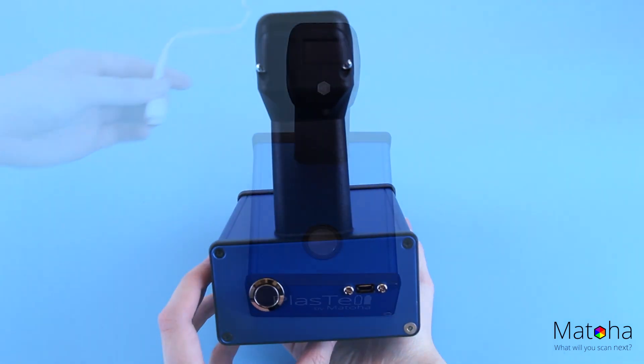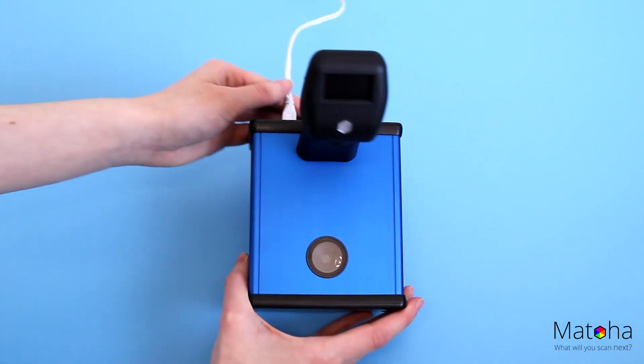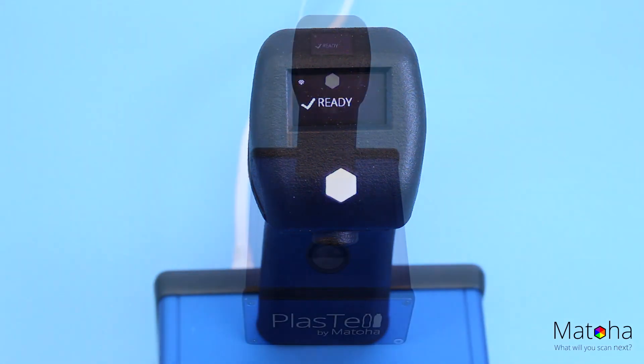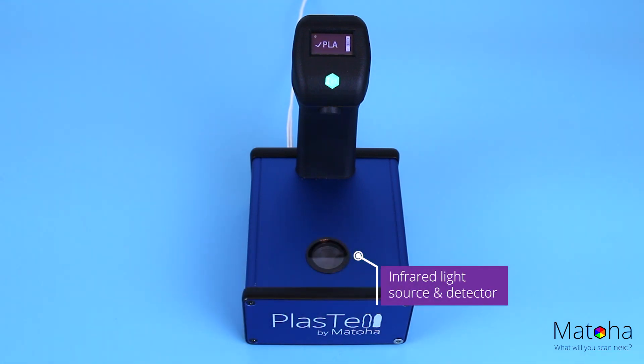This is the same technique that large sorting machines use, brought to you in this highly compact package. Simply plug it in, and within 15 seconds you are ready to start scanning. All you need to do is put the sample over the sensor.